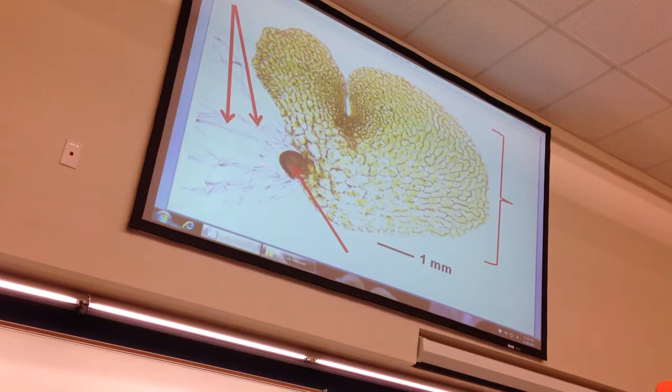And then you should know what this is of this whole structure here. The prothallus of the gametophyte. And then what would these little filamentous things be? Rhizoids. And then what's the circular thing? The remains of the spore, the spore wall. So you can see the spore that we had on these plates five weeks ago. That's what it started with, and then grew the gametophyte. And from the gametophyte, it grew the sporophyte, which is what you're counting today.